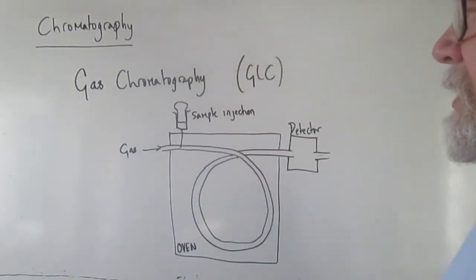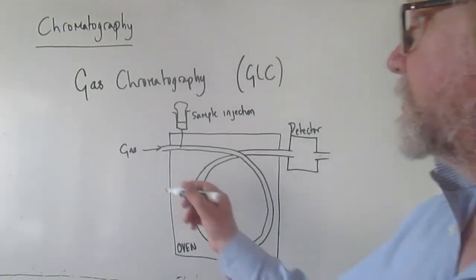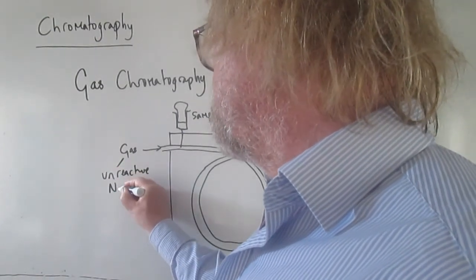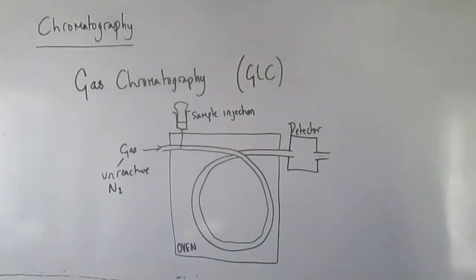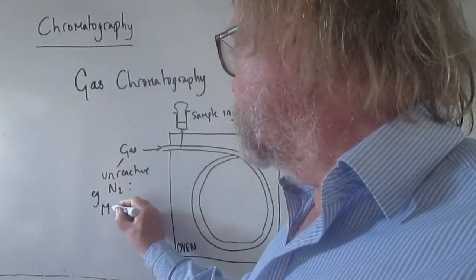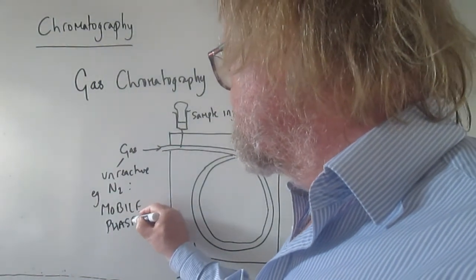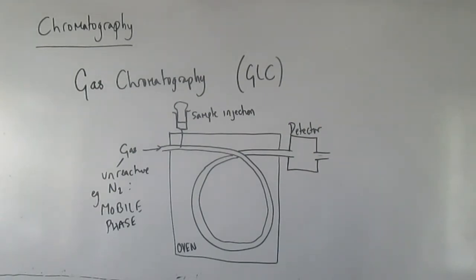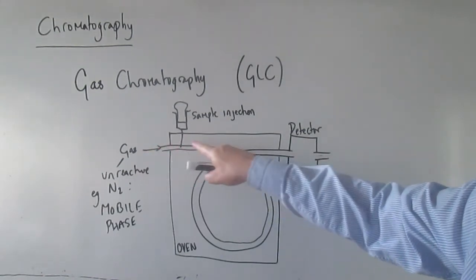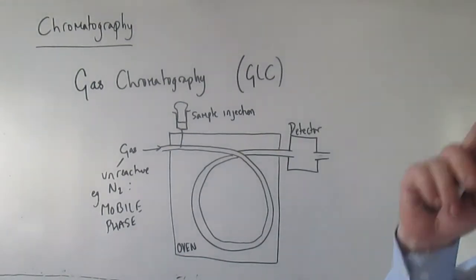And through this tube you push a gas. The gas can in principle be anything, but it wants to be something that isn't going to react with the sample that you're analysing. So you want something unreactive, like, for example, nitrogen or argon, all sorts of things. But you want an unreactive gas, and that is going to be your mobile phase. Just as in TLC, you had a solvent rising up the plate and trying to drag substances with it, here you have a gas with a bit of pressure behind it to force it through the tube, and it's also going to try and drag the substance with it, so it functions as the mobile phase.